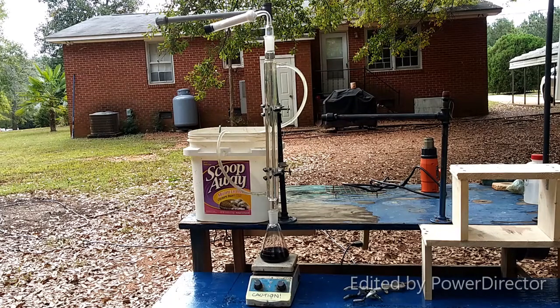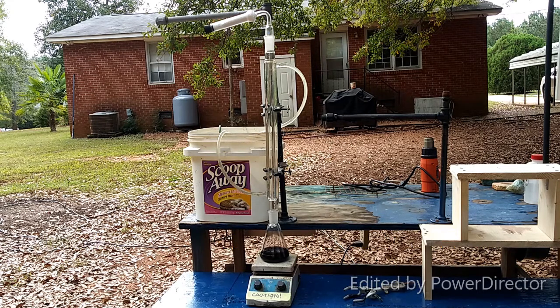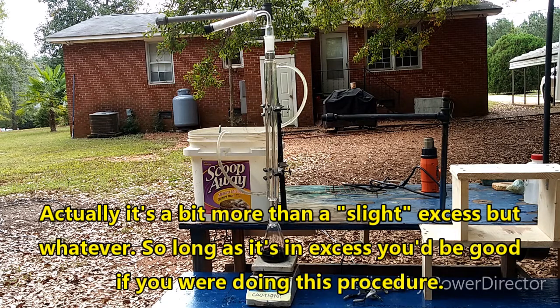All right, everyone, so you can see the basic setup that I've got here. I have a small boiling flask there. It's a 250 ml boiling flask. There's 100 milliliters of toluene in there, 4.7 grams of iodine, and about 2.7 grams of ground antimony, and that's a slight excess of antimony.